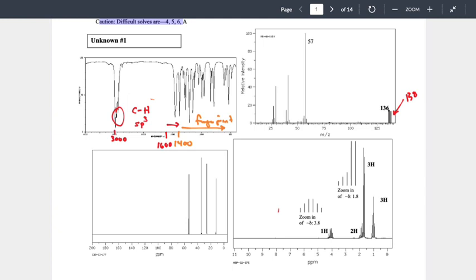The last part of that I'm a little bit less certain of is that iodine is so large that it can ionize, to be detected by the mass spec. And that could show up as a signal at 127, where iodine is just chilling on its own. So if you're seeing a signal at 127 and you have a massive molecular weight, that's a pretty good tip-off you've got iodine. Very, very rare, but it can show up. Make sense? Okay, which now takes us to the next two systems.